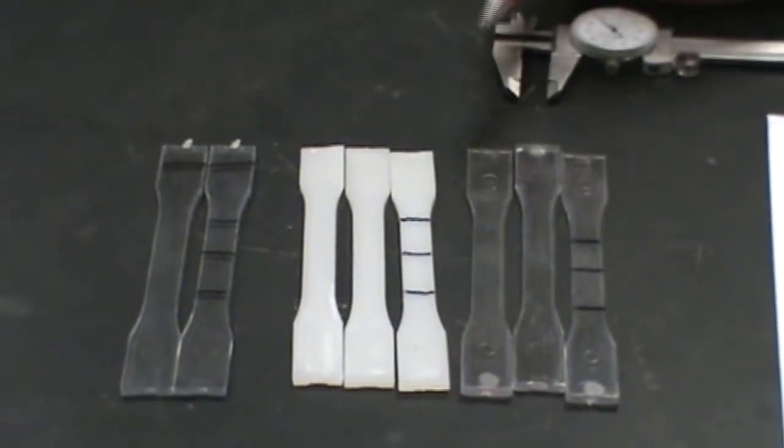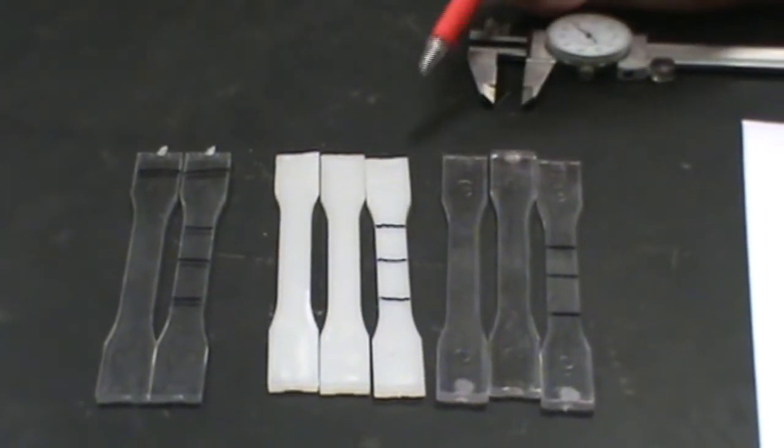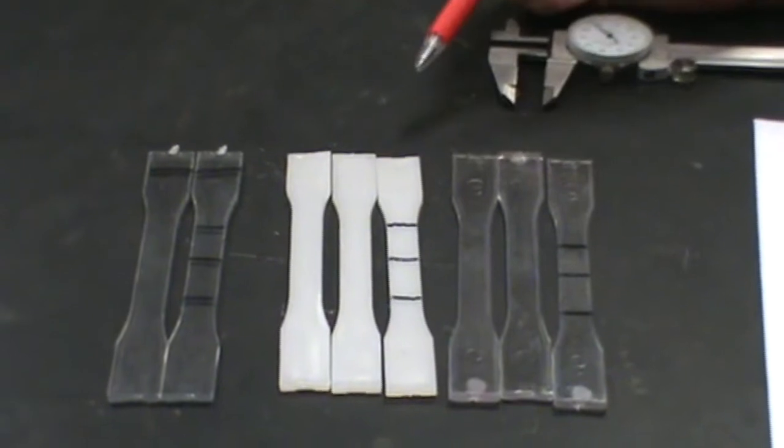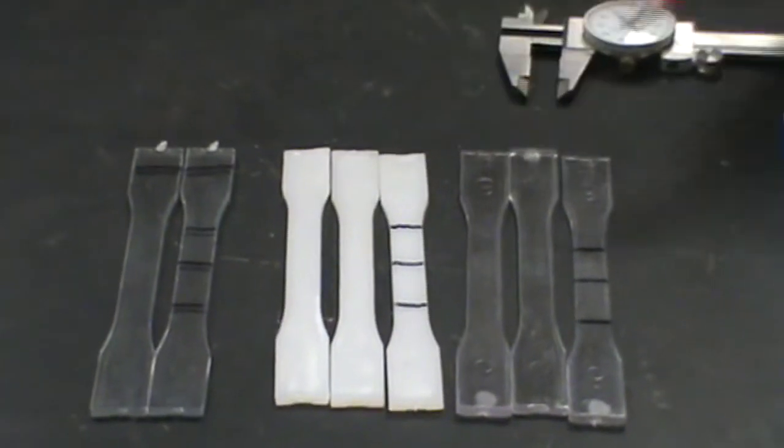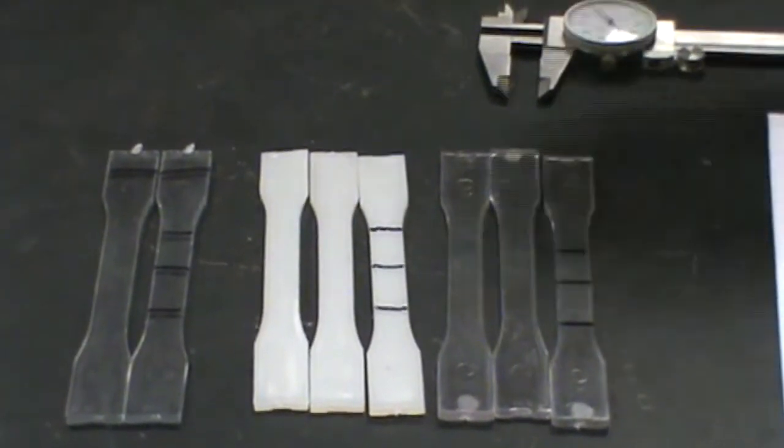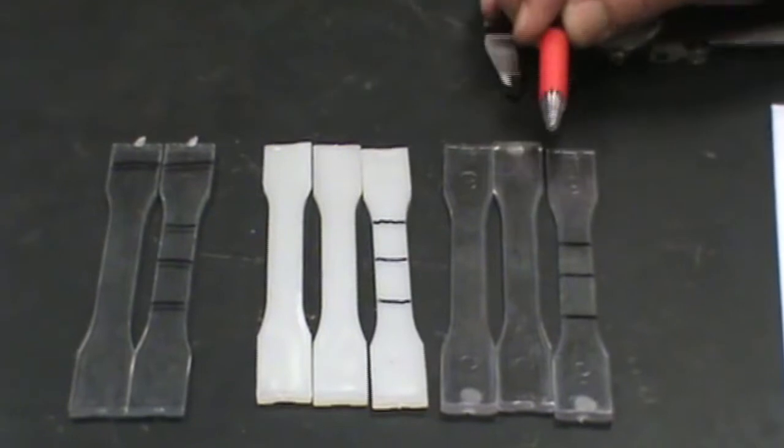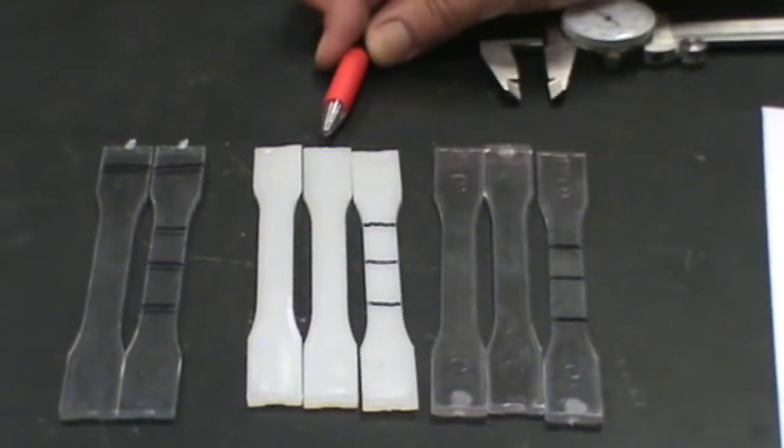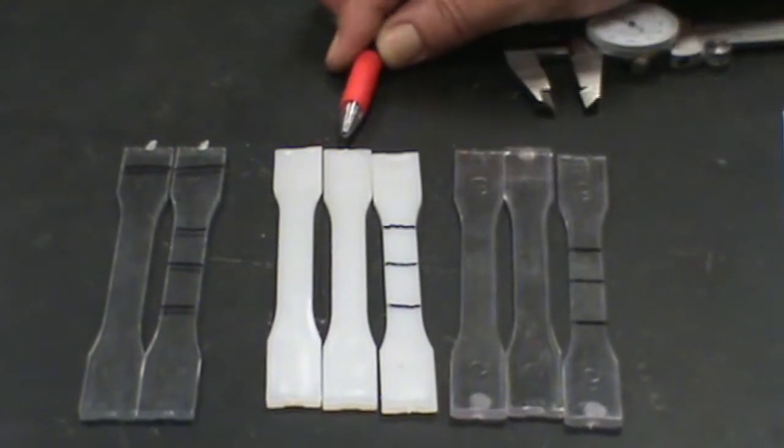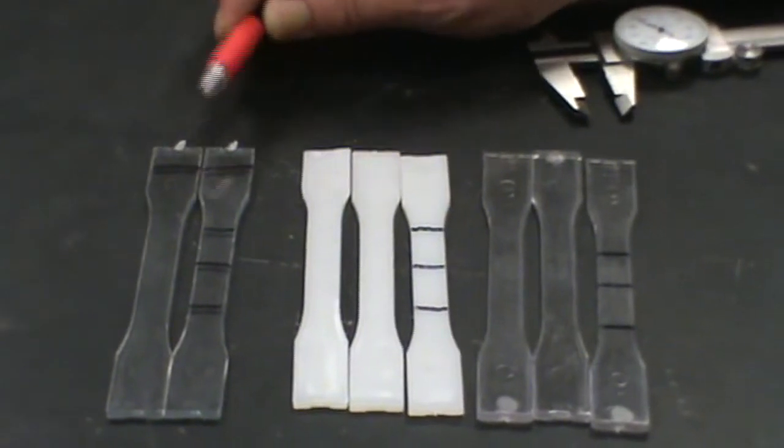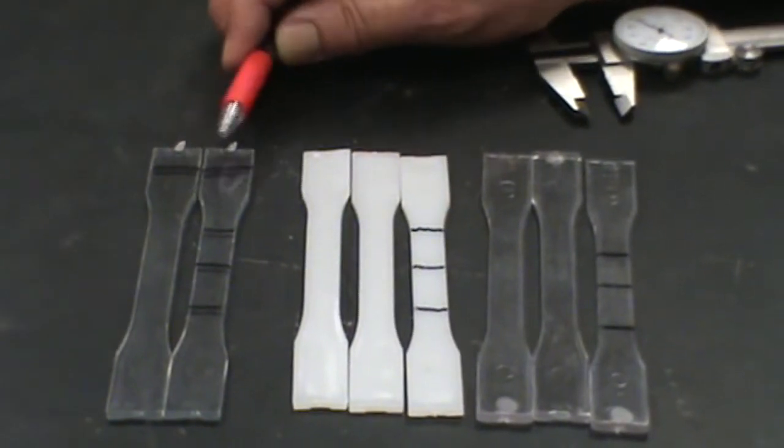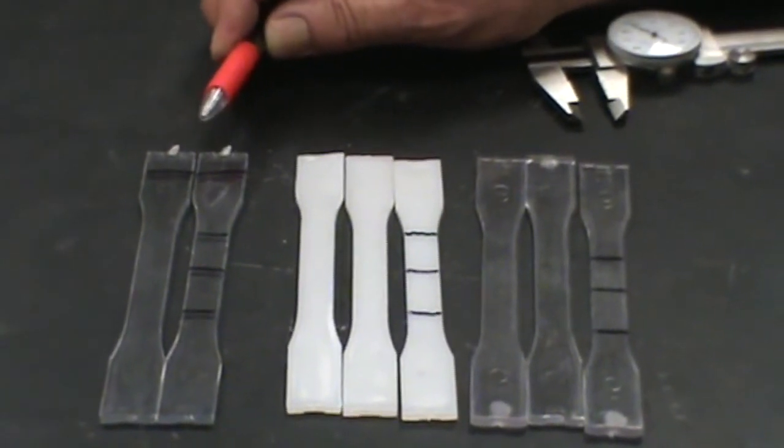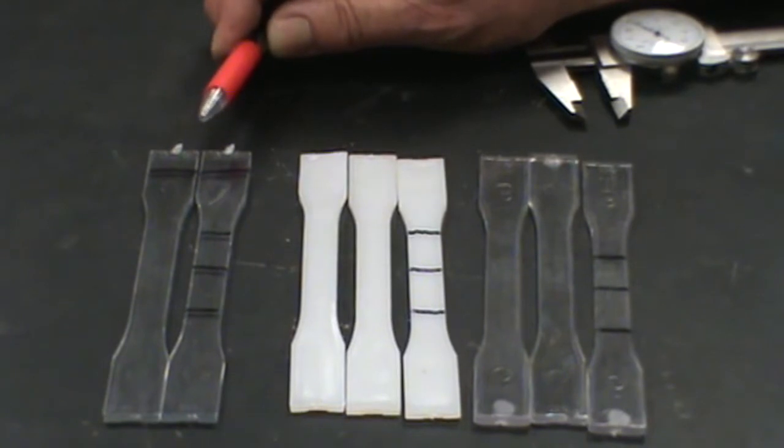This is your polymer tensile testing. Today we're using three polymers. This clear one without the line is polycarbonate. The creamy one is polyethylene. The one with the black line at the top of the tab here, that is polystyrene. That's how you identify the two here.